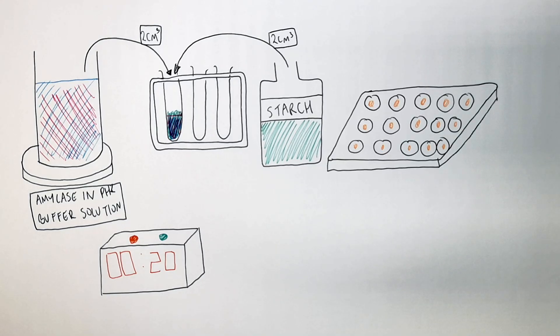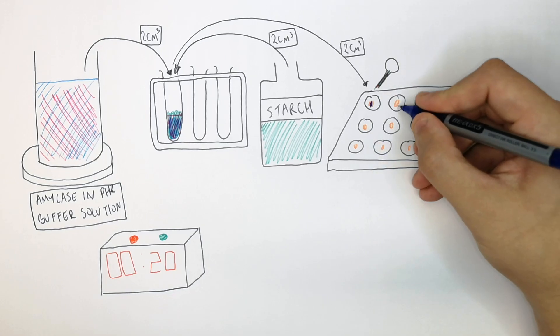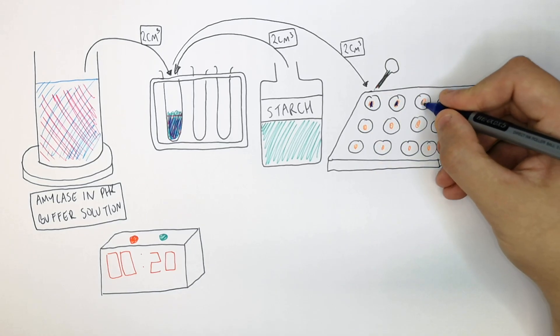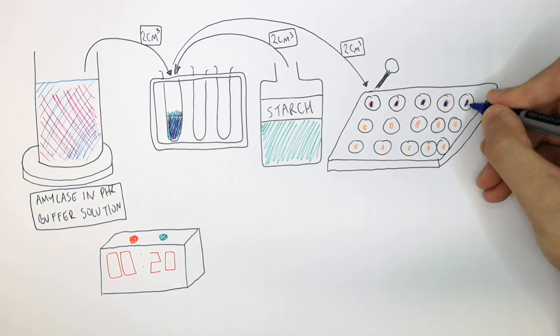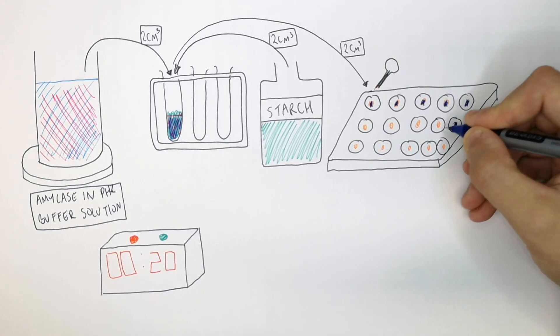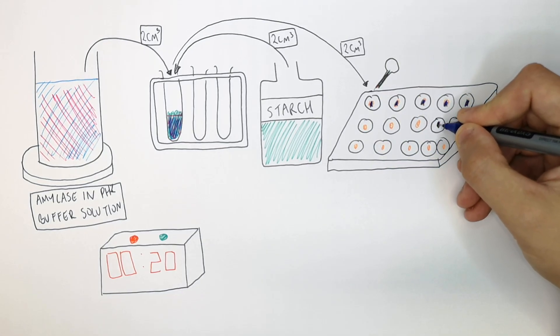Get your well plate with one drop of iodine in each well, then press start once the starch and amylase have been mixed. Every 20 seconds, add one drop of the amylase, starch, and pH solution into each well.